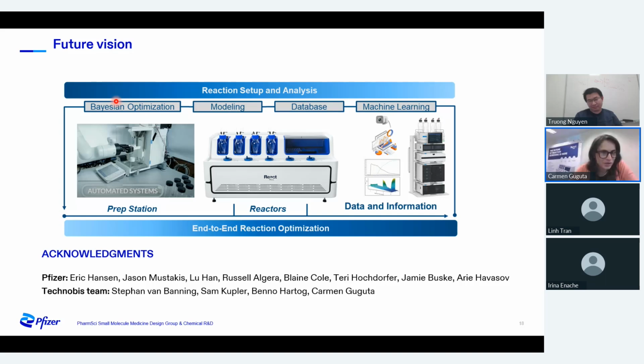I have another one. For reactions that remain slurries at the reaction temperature, so inorganic suspensions, have you encountered limiting cases where this was an issue with representative or consistent sampling?